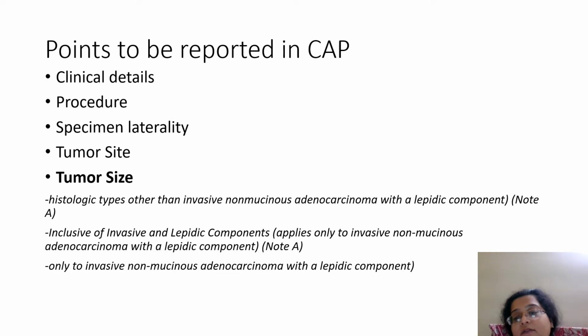On the basis of that, can we identify the laterality of the specimen? It is always easier to identify the laterality if the specimen is marked and the hilum is present. We know the hilum is posterior, so we can anatomically hold the lung in the correct position. The apex goes above, and the diaphragmatic surface is below. Then the site of the tumor and the size of the tumor, after taking the weight of the specimen. Then this is just for cancer, okay? I'll take it later on when I take malignancies. This is actually for microscopy.